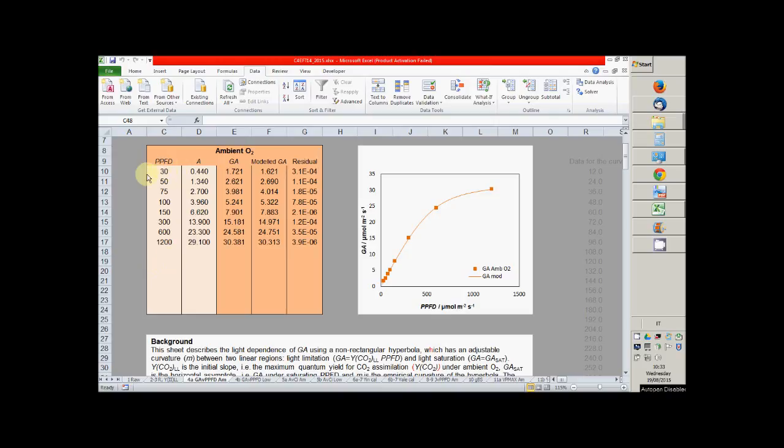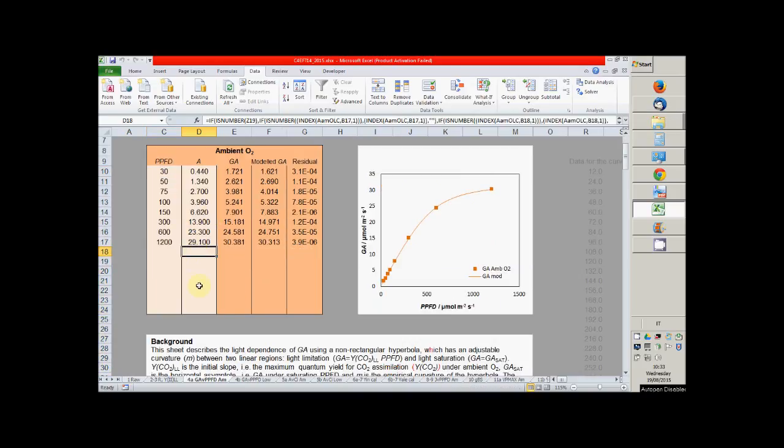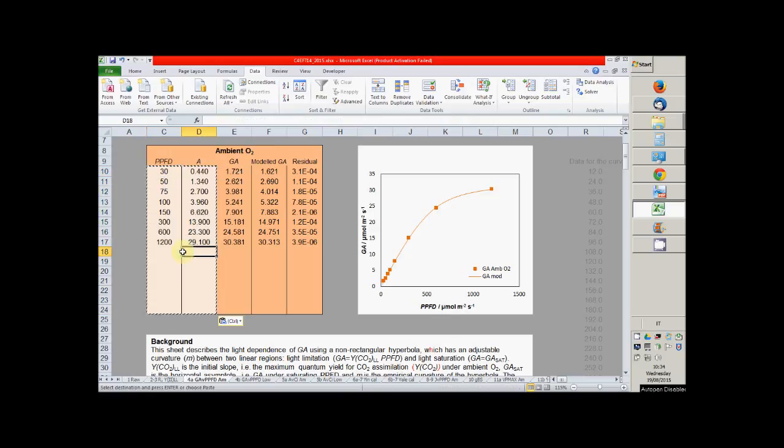We may not be happy with the copied values, and we may want to change individual data points. The cells with the light colored background can always be overwritten. So in this case, for example, we may copy and paste values.